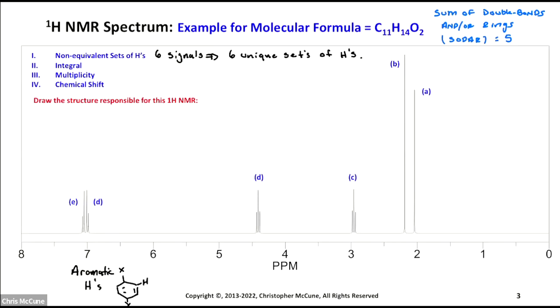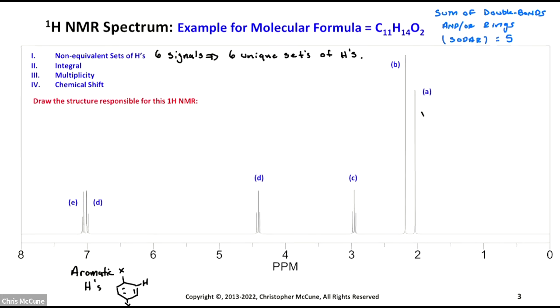So what I will say is that if I integrate this to 1 and B has the same number of hydrogens, it's also going to be set to 1. So it's a relative number of hydrogens in that structure. So when you're integrating an NMR spectrum, you usually find a peak where you know the integral, set it to the number of hydrogens giving rise to that signal, and then all the other peaks will integrate relative to that, so that usually the integral equals the number of total hydrogens, unless there's symmetry.